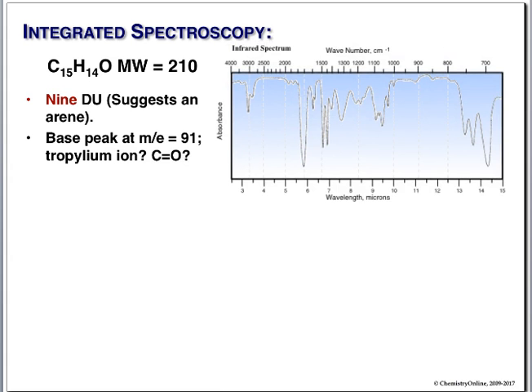There's the IR. Run through your standard peaks. 34, 31, 29, 22, 17, and 16.